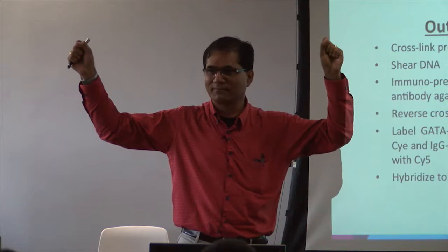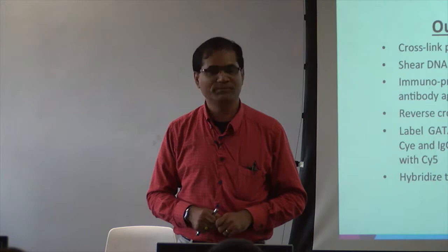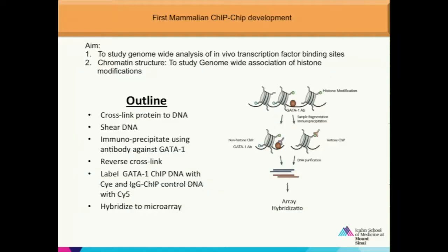Okay, maybe many people need to know, right? So in a ChIP, what you do is you take the entire human chromatin. The chromatin is the DNA and then histones together, right? And then smartly, if you would isolate that chromatin by phenol chloroform extraction or general extraction, you break that association between protein and DNA. Right?